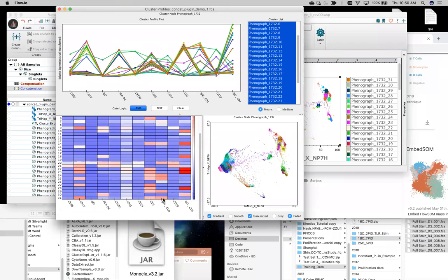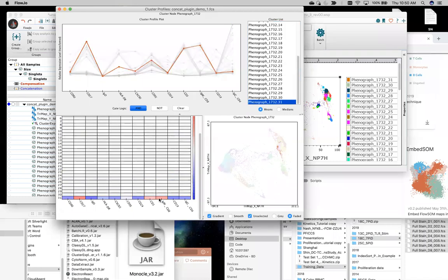So let's look across CD8 and see, okay, this population here, for example, is probably cytotoxic T cells. And that means to me that probably all of these are in some way cytotoxic T cell like. The NK cells oftentimes get mixed in there as well. Looks like I don't have an NK marker here that I would recognize, so I'm not going to try and find that, but just to note that that's there.